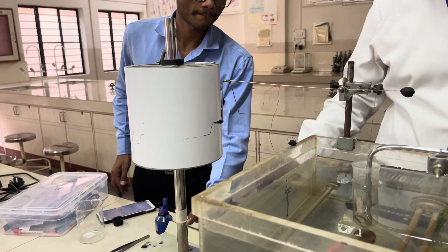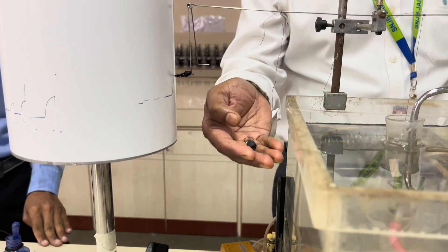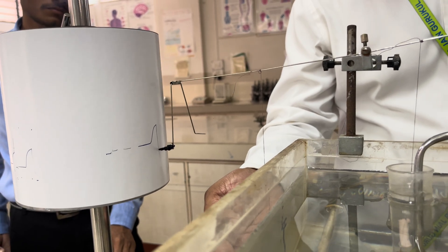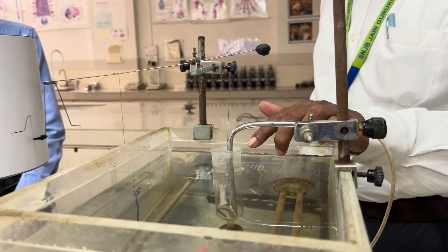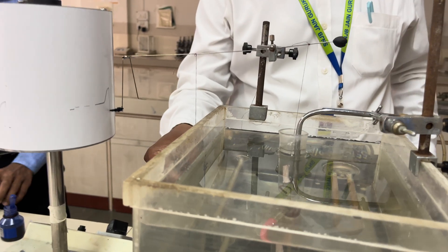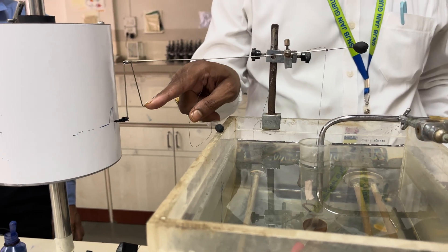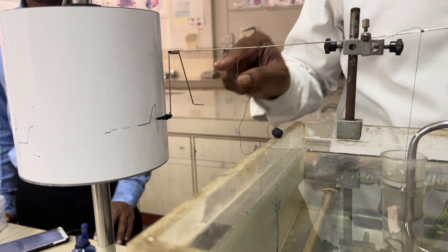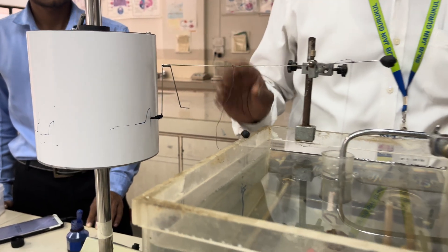After 45 seconds, stop the kymograph recording drum and put the load down so that you get a straight line. For 15 seconds, carry out washing of the tissue — a minimum of 2 to 3 washings should be given. Then, for the second response, put the load above again and observe that the writing tip is at the baseline area. You can then take another baseline, increase the dose, and record the response. This is all about the experiment.